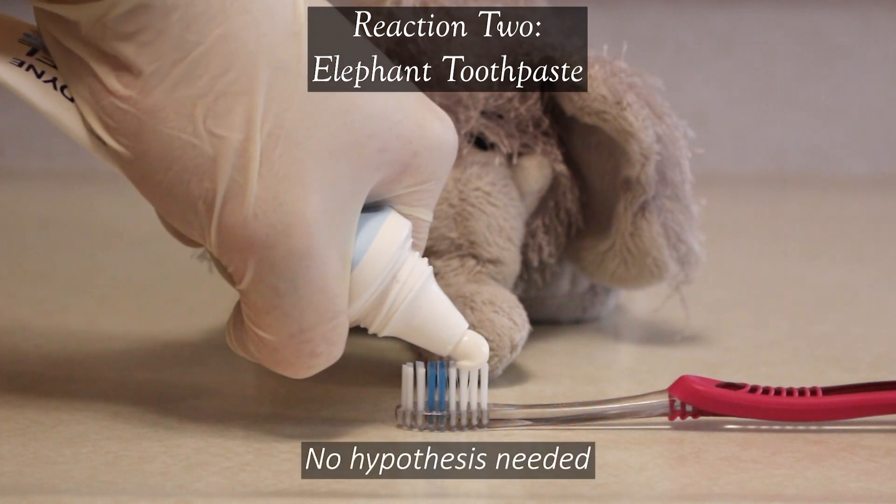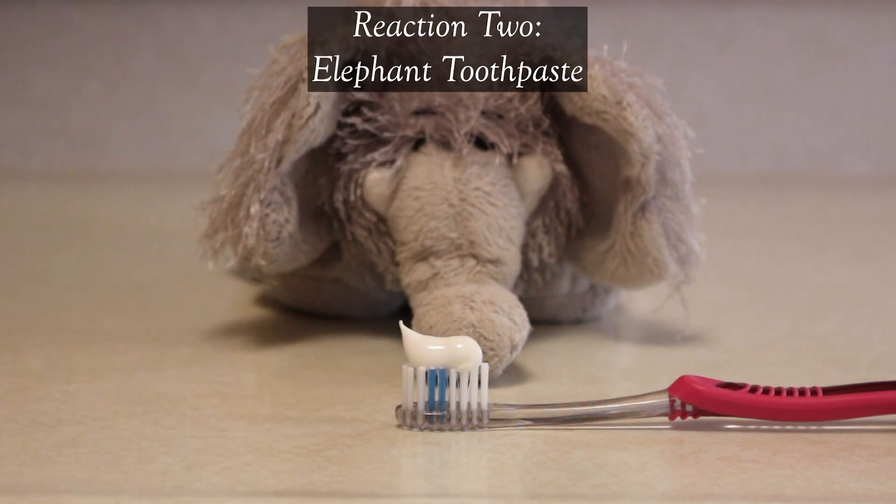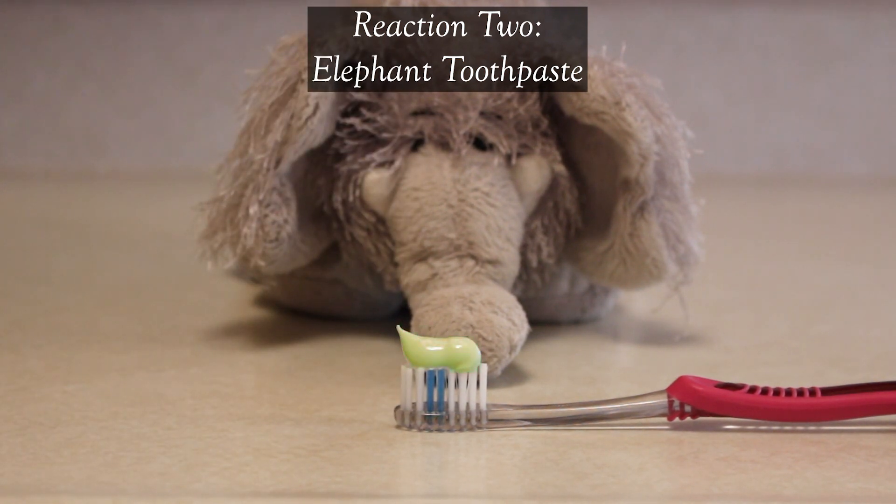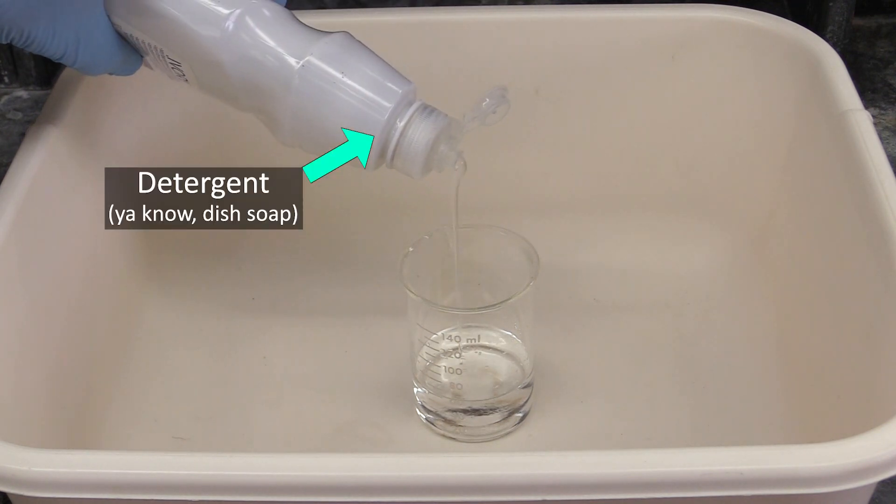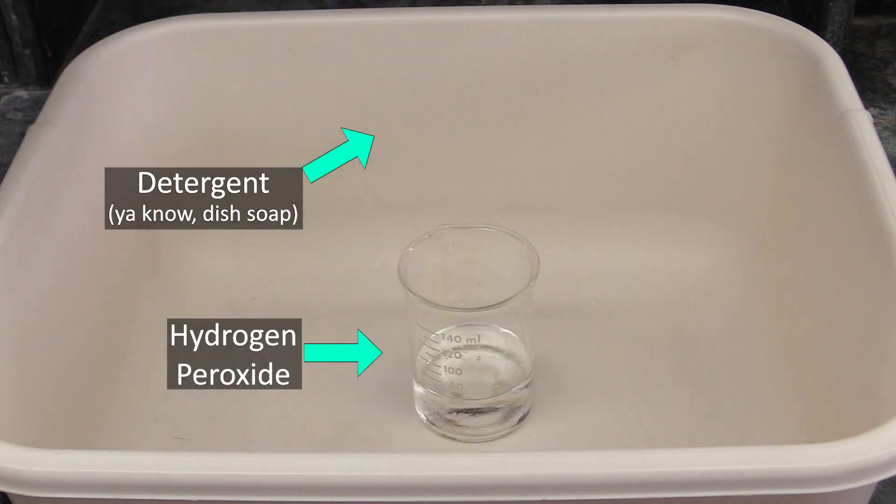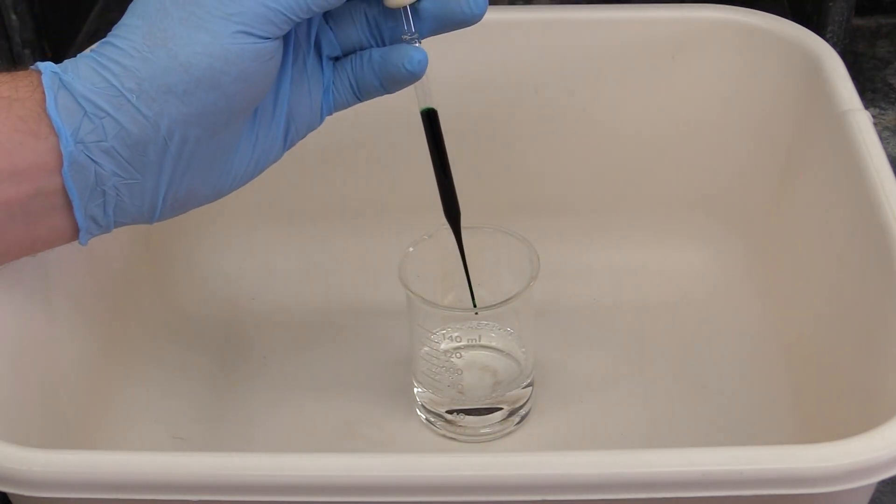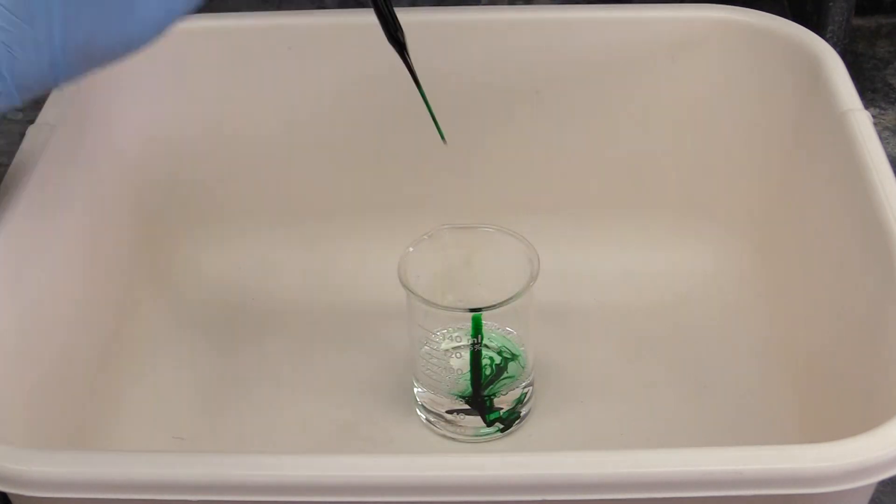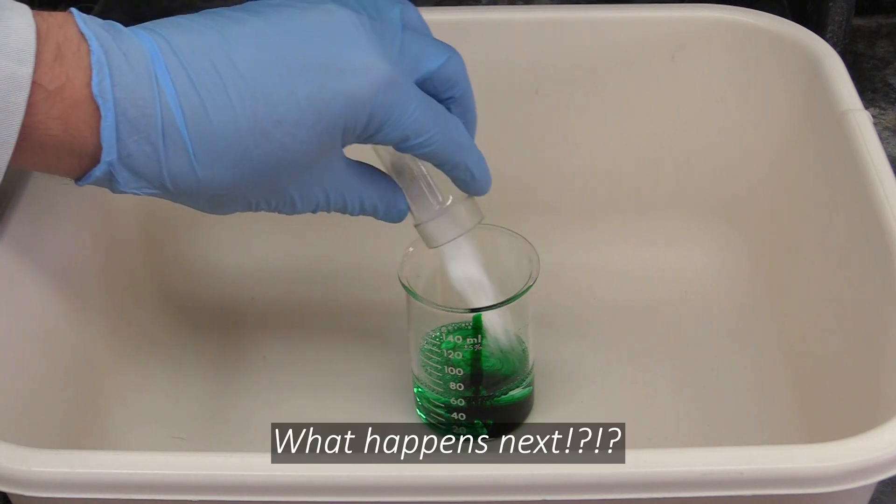There's no hypothesis to form for this one, it's mostly an observational exercise. It will give you a chance to be a little creative with the toothpaste's color, so that's neat. To make the toothpaste, you'll mix some detergent into a solution of hydrogen peroxide. Add a little food coloring if you want, then add a small scoop of sodium or potassium iodide, and stand back and observe.